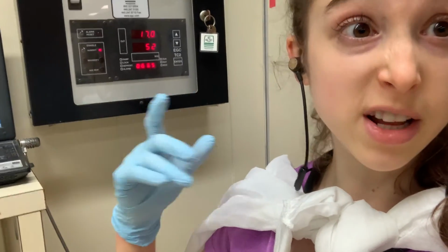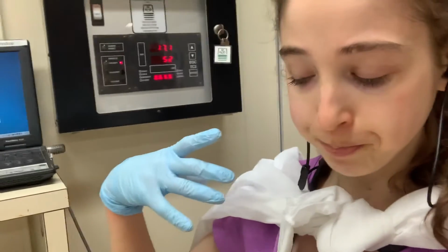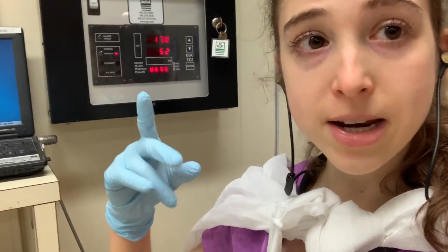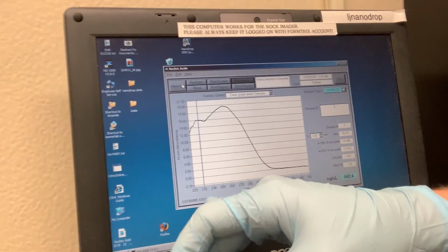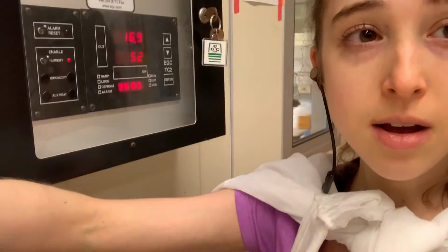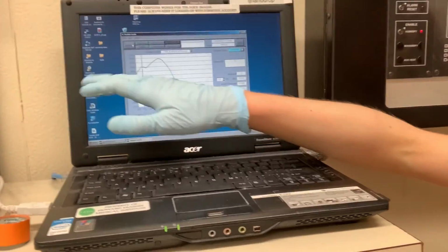When I talk about RNA and DNA absorbing UV light, well, UV light is itself like a spectrum. So we can look at specific wavelengths to get more information about the purity. This absorbance is at 260, sorry. If you look, there shouldn't be much absorbance at 280. I mean, there's still some, but if you look at the ratio of 260 to 280, that's going to tell you about whether you have any protein contamination, because proteins most strongly absorb at 280. And we also look at 230.